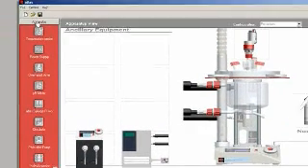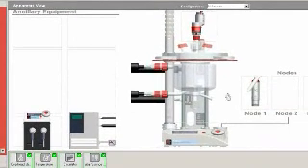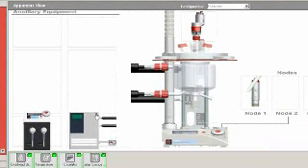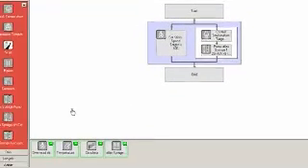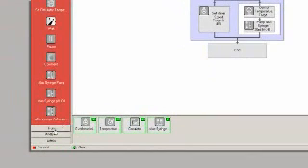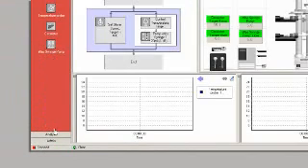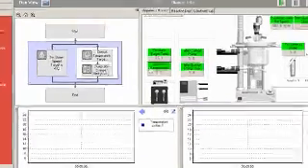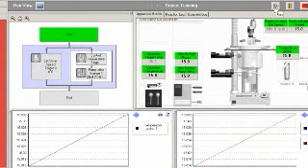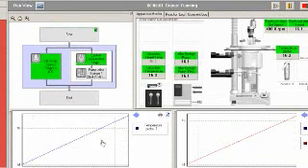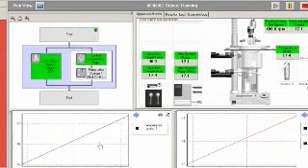The software has three major views: Apparatus to define the sensors and controllers, Recipe to define the reaction conditions, and Run for automatically conducting the experiment whilst recording and displaying the data.